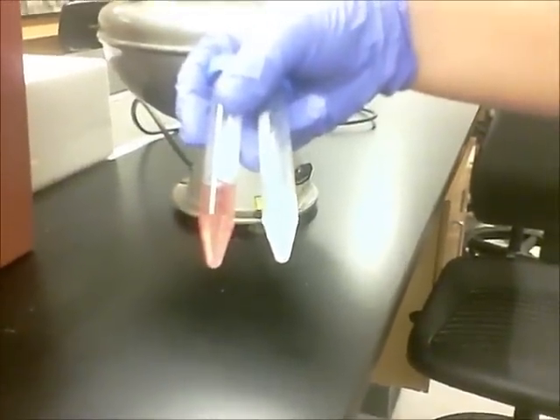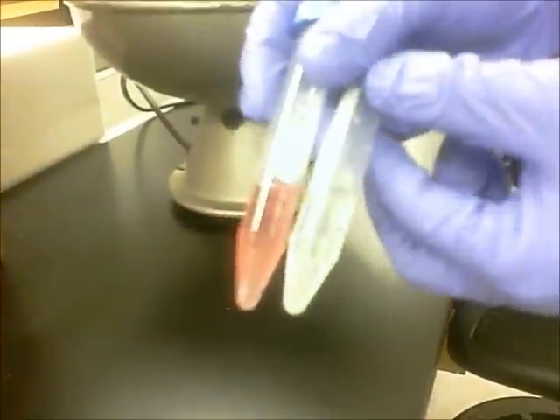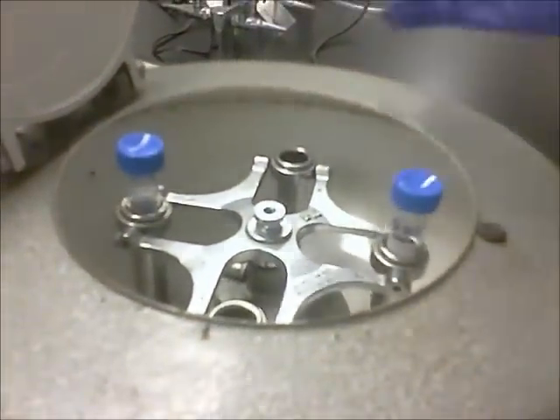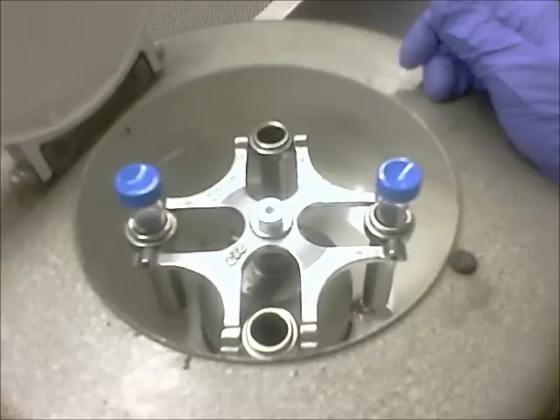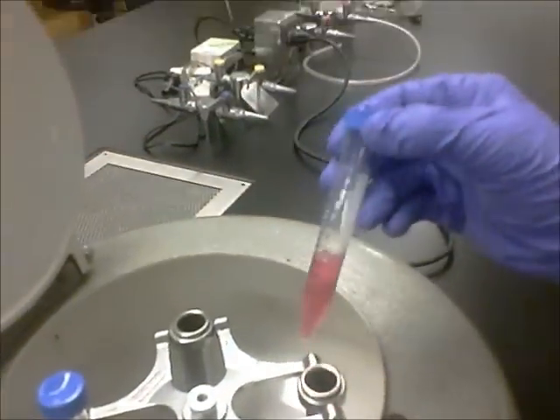We're going to take our tube to the centrifuge, but we're going to need a blank in order to balance it. We'll go ahead and place it into the centrifuge, close the lid, and turn it on for a few minutes. It's been approximately five minutes, so we're going to go ahead and remove our tube from the centrifuge.